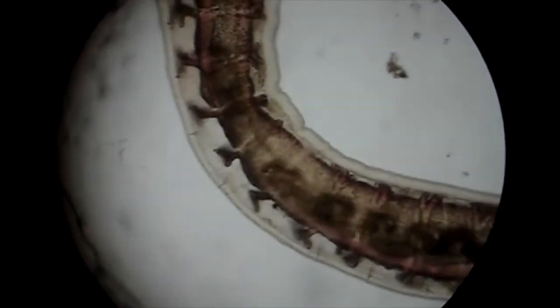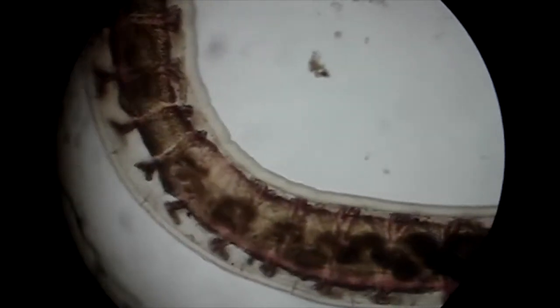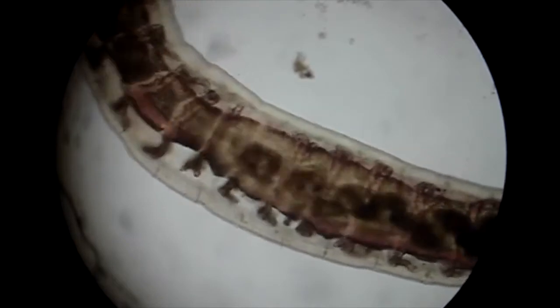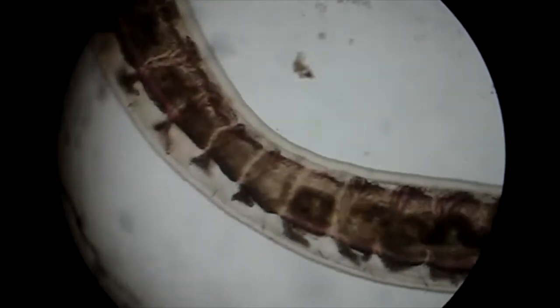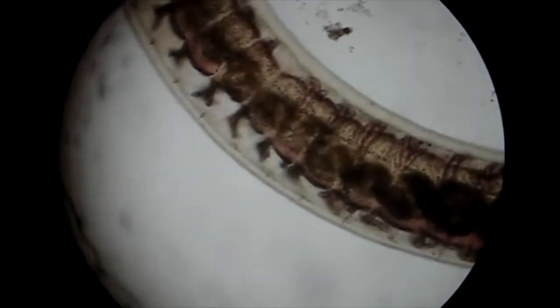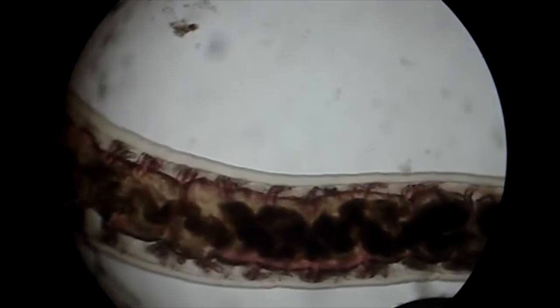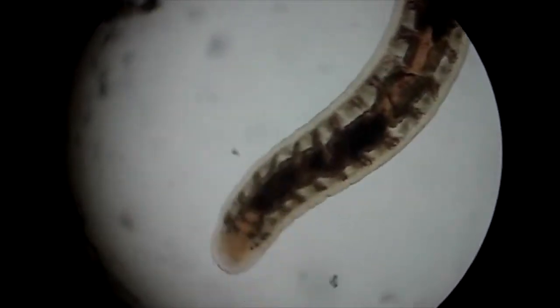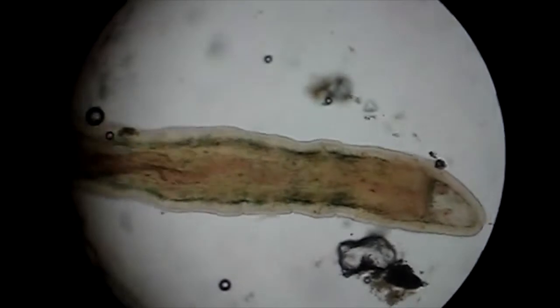Can you see these bits inside the body? I think that's waste material. It's gone through the gut, or is going through the gut. You can see the wiggly shape to the dark matter in there, all ready to be passed out the other end, I think. These worms, although they're quite big, can actually also be quite hard to track under the microscope, because you can only see one section of them at a time, and they keep heading off the screen and you have to keep following them.